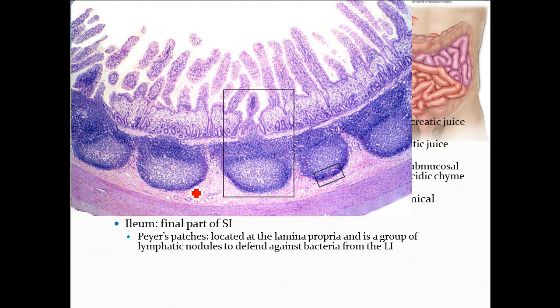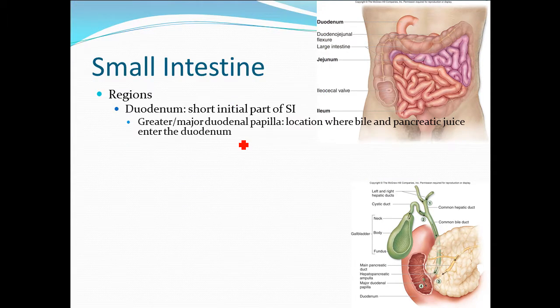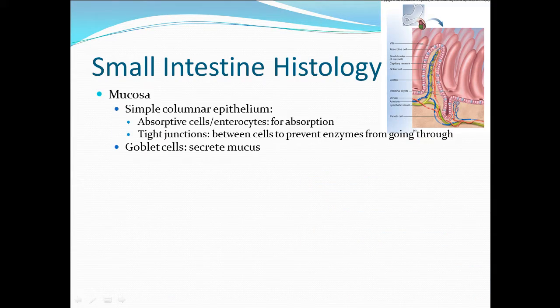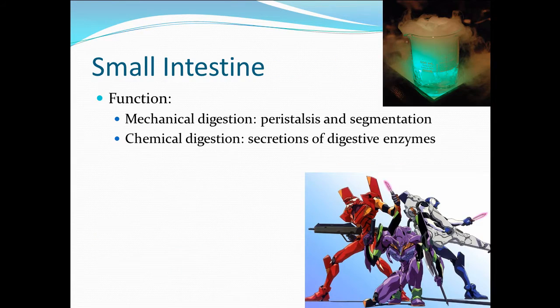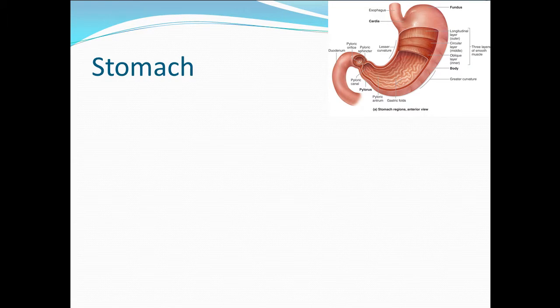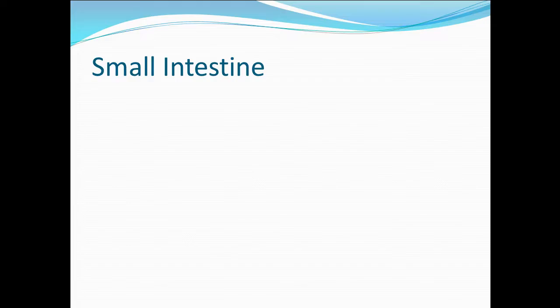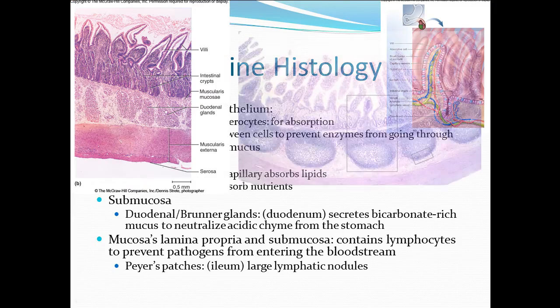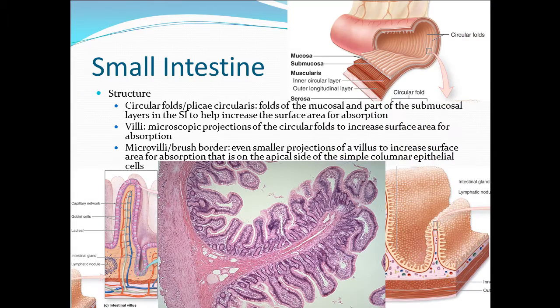Yes, so you have to look at the... Here, let me go back. I think this is... No, this doesn't show you. I think when we looked at it, it was over here? No. That wouldn't be the blood vessel itself, would it? Would they be the blood vessel? No. Okay, so it wasn't there. Where was it? I thought I had it. Oh, here we go. Okay.